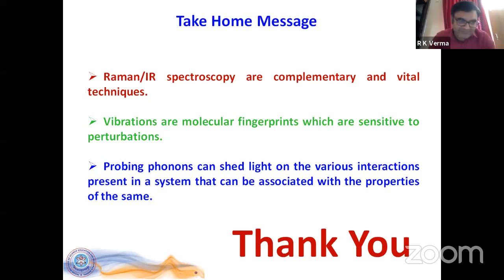There is one from Dr. Thakur Prasad. What is the difference between Raman spectroscopy and surface enhanced Raman spectroscopy?